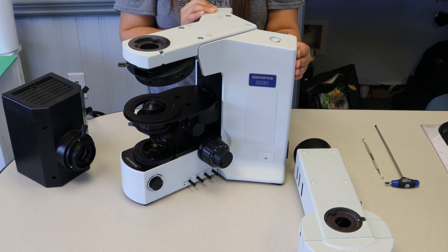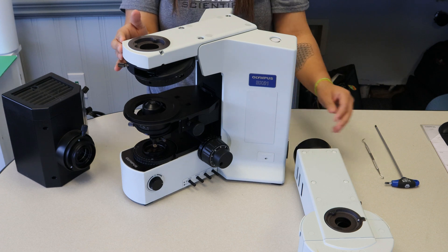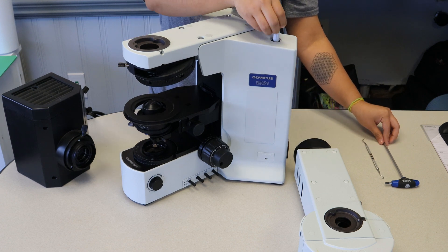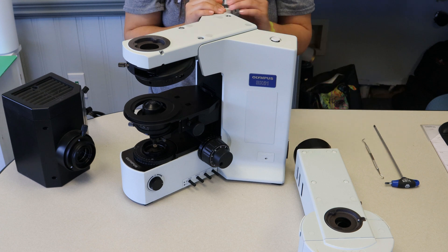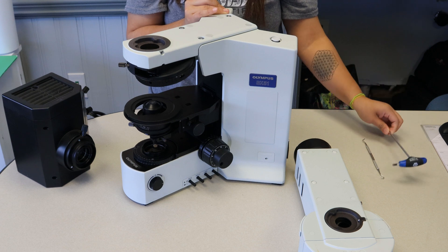So items you'll need are, of course, your BX-series microscope. Today we're using the BX-51. The 3mm Allen wrench included in the upper right-hand corner of the stand. A 4mm T-handled Allen wrench. It doesn't have to be T-handled, but we find that helps give you a little extra leverage.